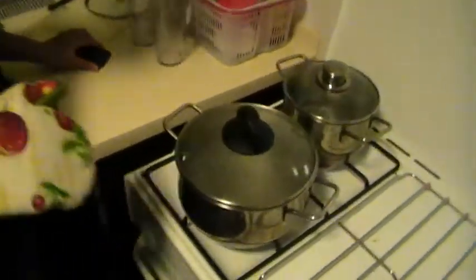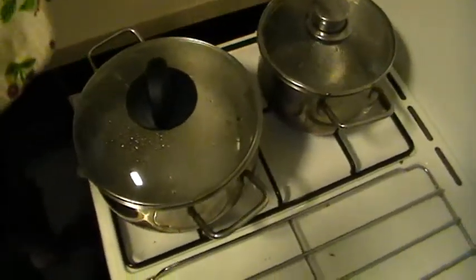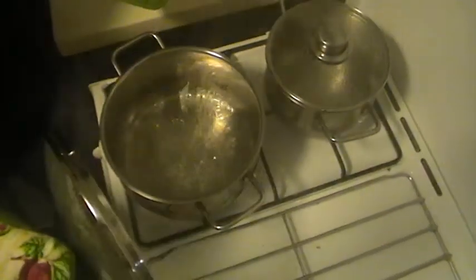So now it's been about 4 minutes and 15 seconds. And now we're going to check how they're doing. Oh my god, this is going to be hot. I'm going to have a look at the pure water now. Really boiling at a really fast pace. If you look, bubbles are just coming in all around. It's probably reached its boiling point. And there's a lot of vigorous bubbling.